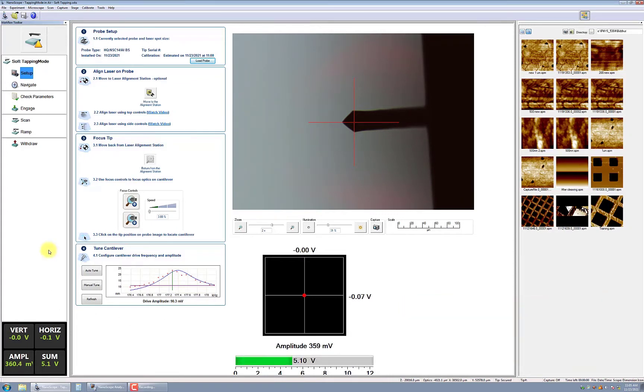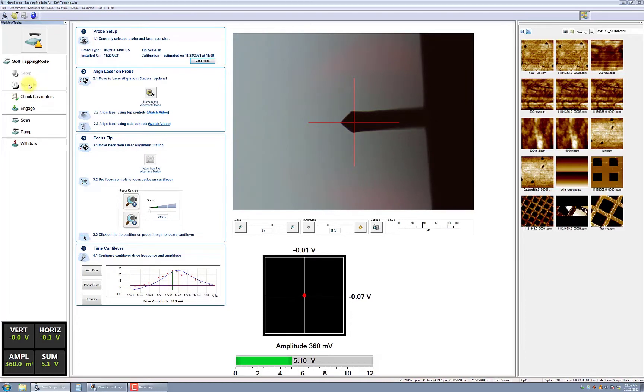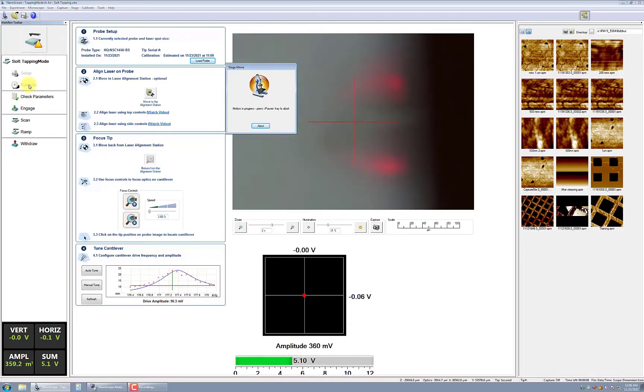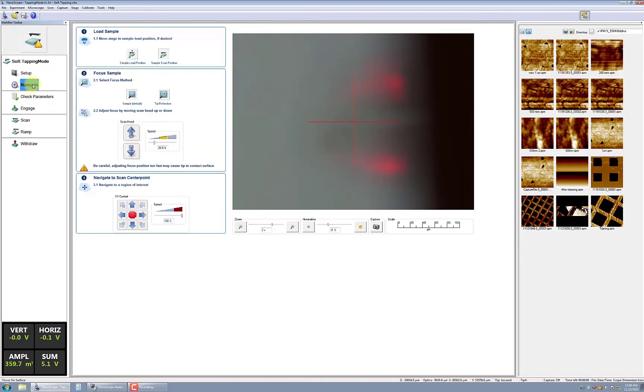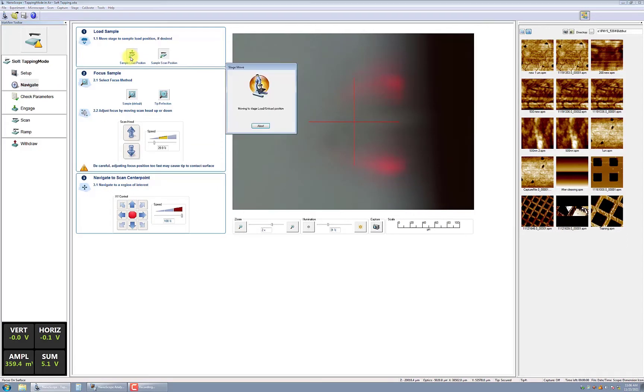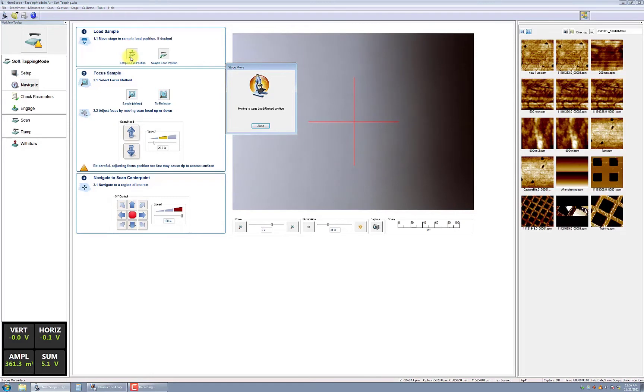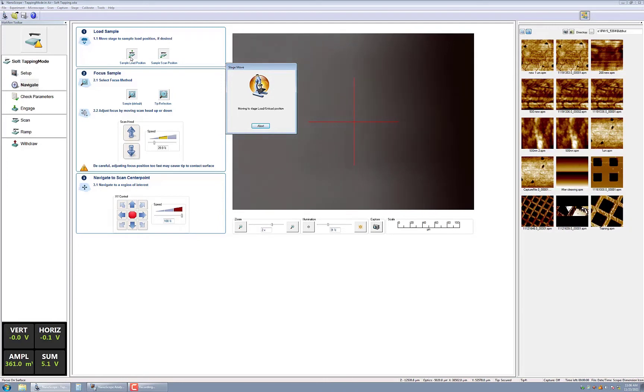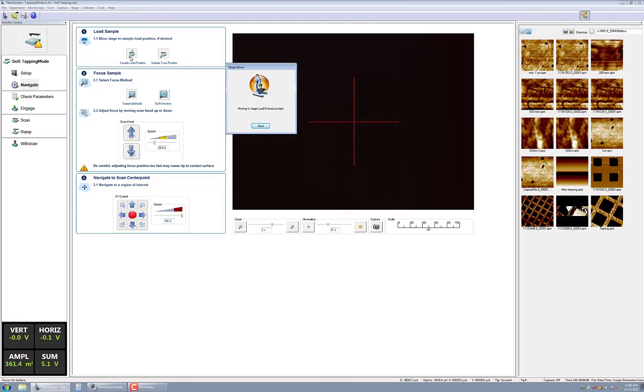Click on the navigate button from the workflow toolbar and then click the sample load position. The stage will move so you will be able to load your sample using either the magnetic chuck or the vacuum chuck. Keep in mind that the magnetic chuck does significantly elevate the sample, so take care to allow sufficient space when moving the sample underneath the scan head.